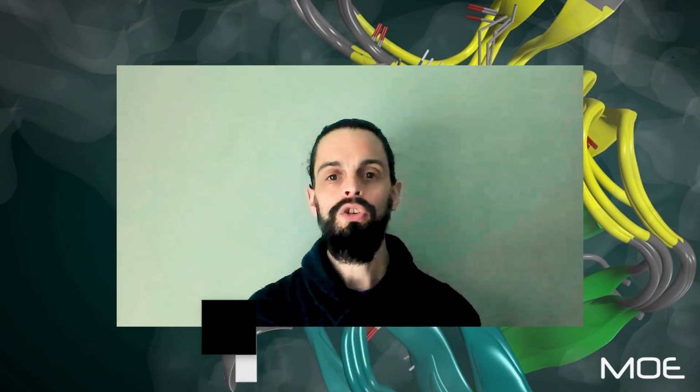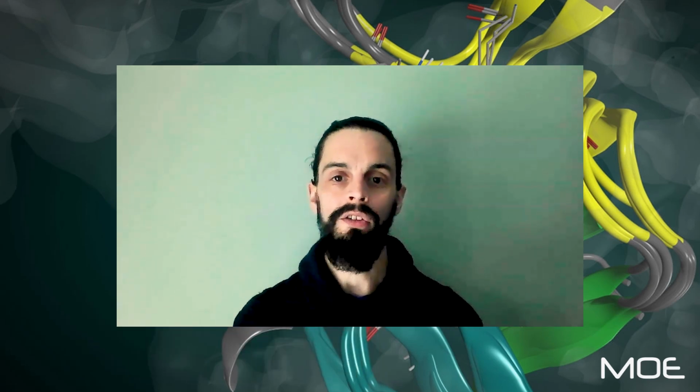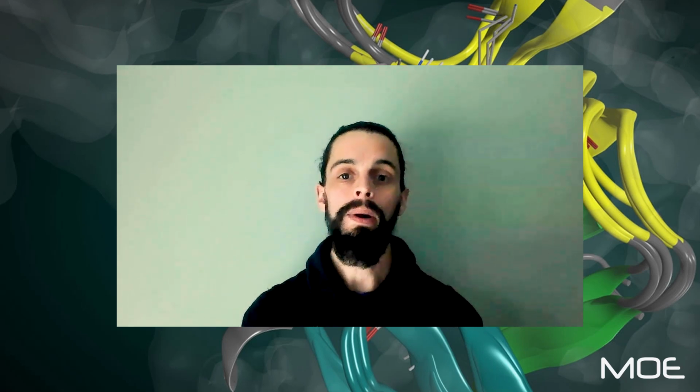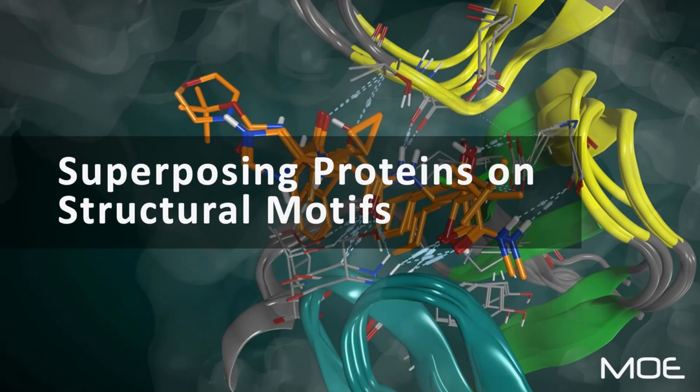Today I'd like to show you how to superpose two or more proteins that have some reasonable degree of secondary structure similarity but lack sequence similarity. This would be a useful workflow for comparing binding pockets or identifying structurally conserved regions. So let's get started.